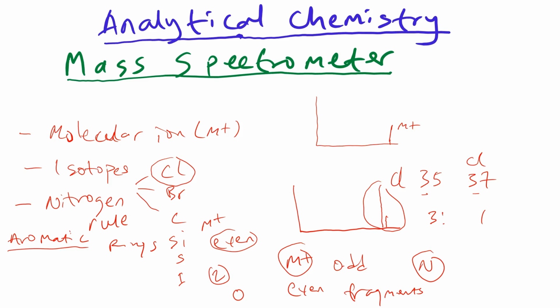Maybe it could be as tall as this. If this is M plus and this is an aromatic compound, they have a prominent molecular ion, M plus ion.